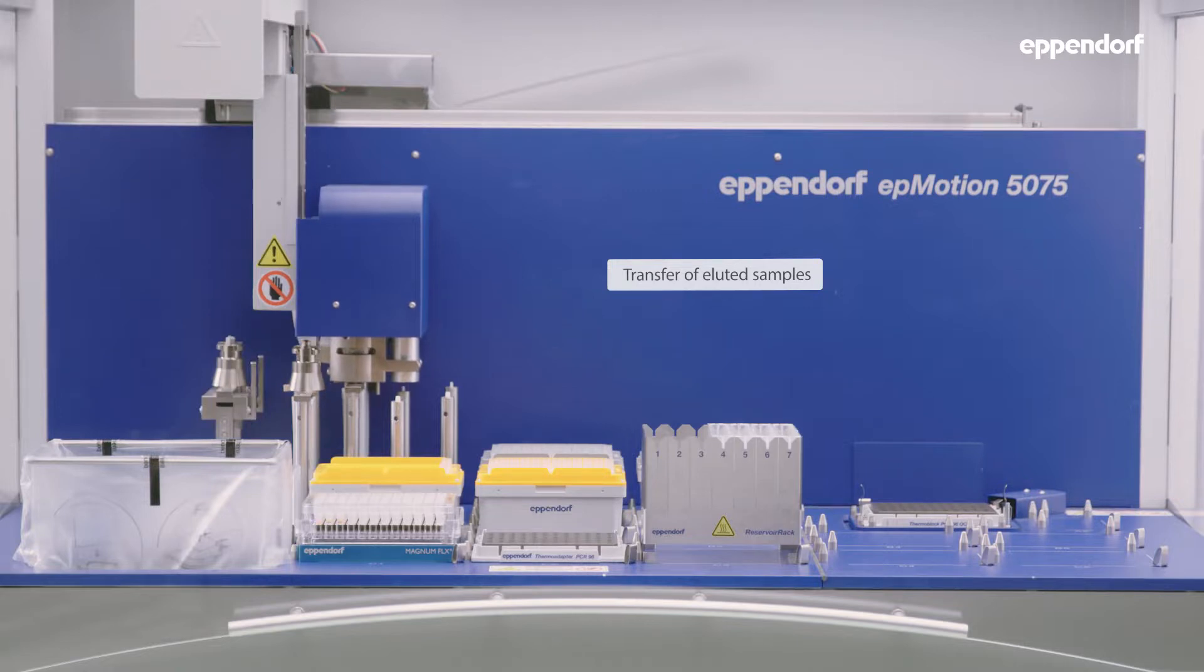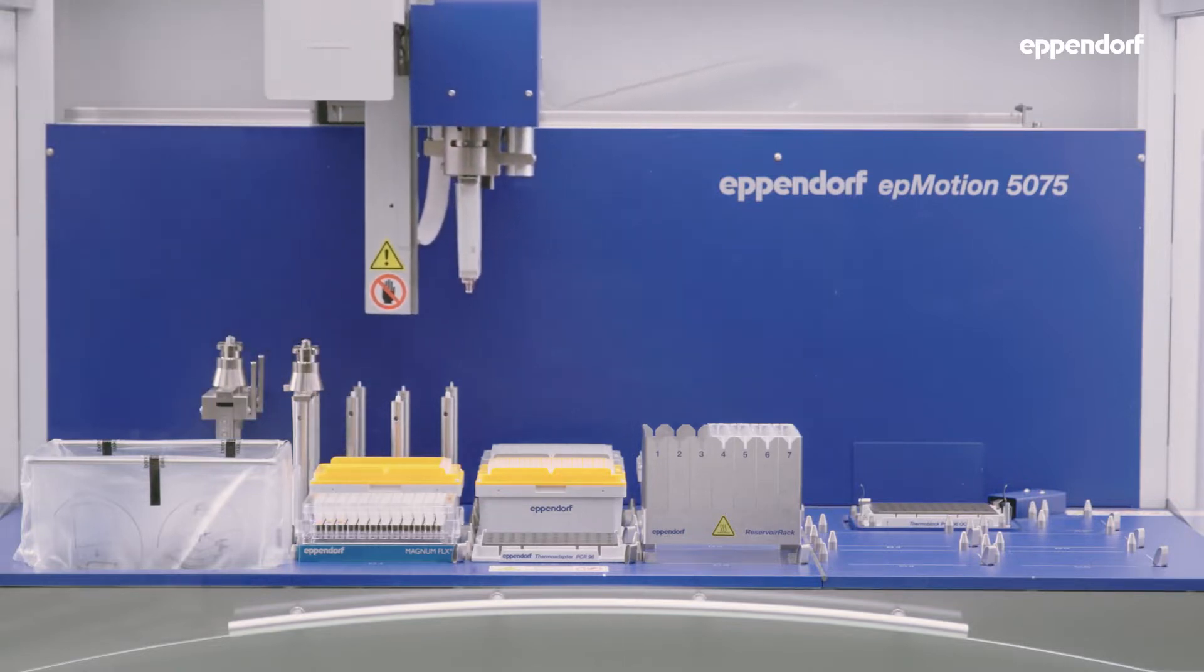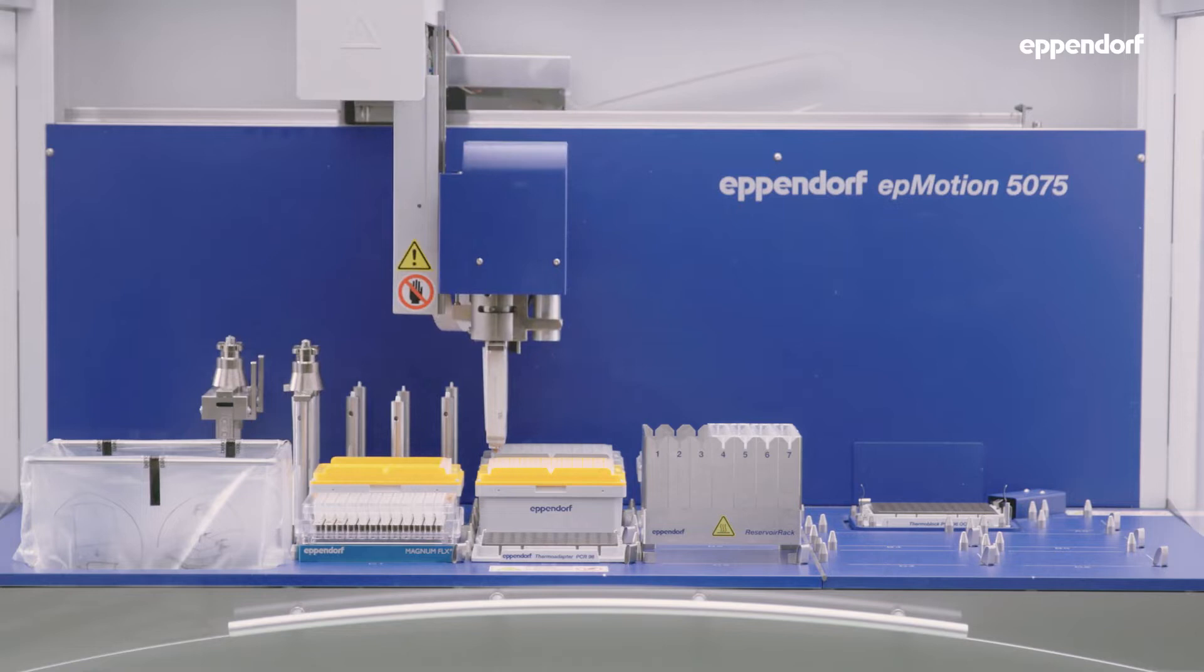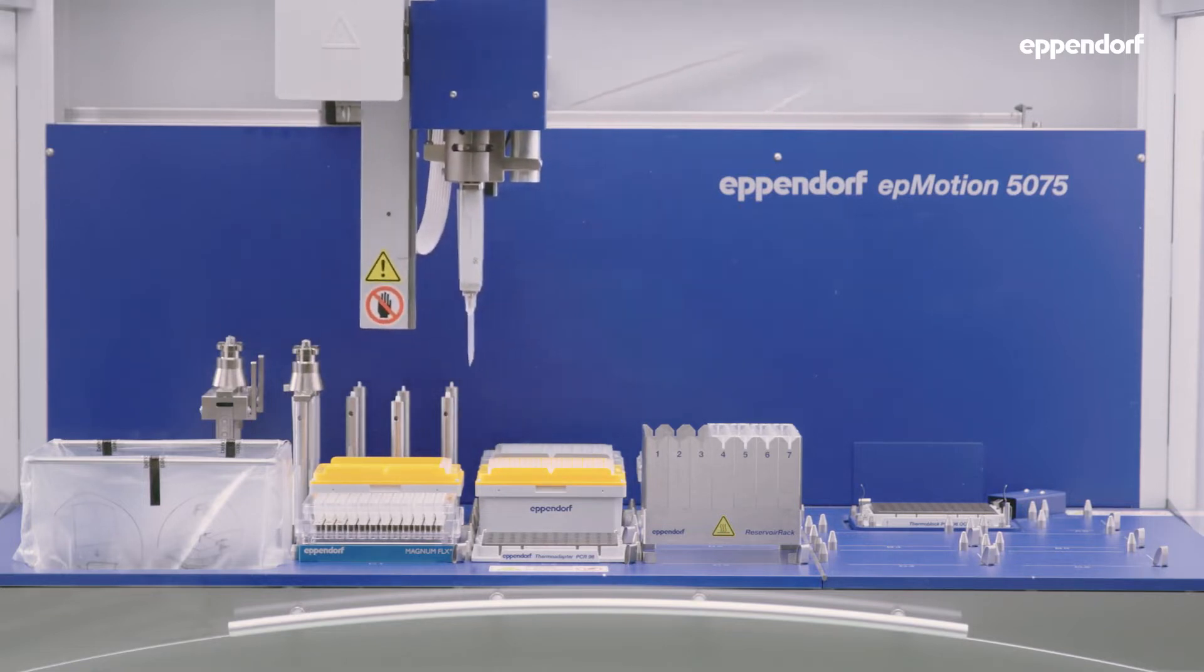To finish the cleanup process, the supernatant containing the nucleic acids is transferred to an empty well of the sample plate using a 50 µL H-channel dispensing tool.